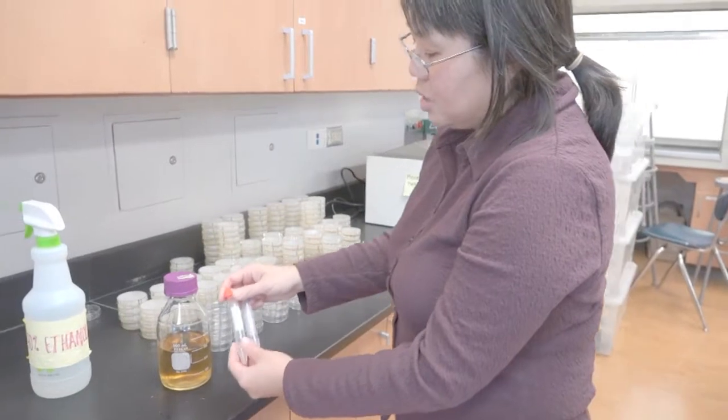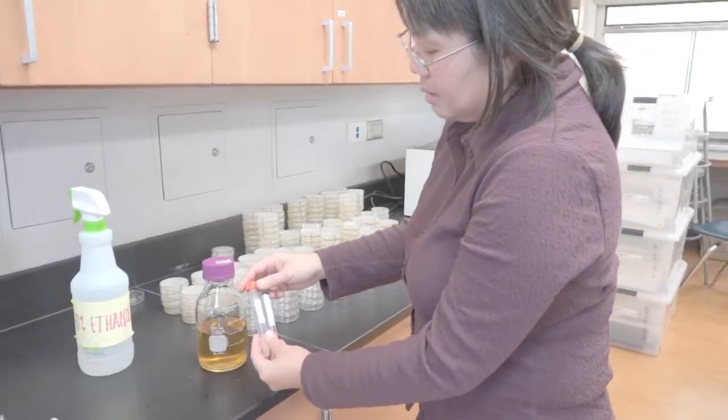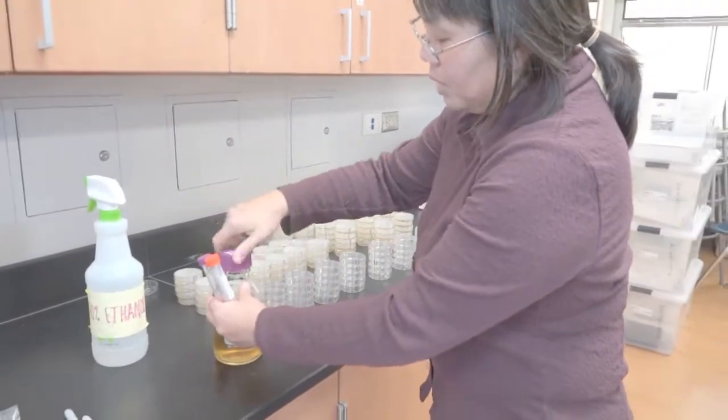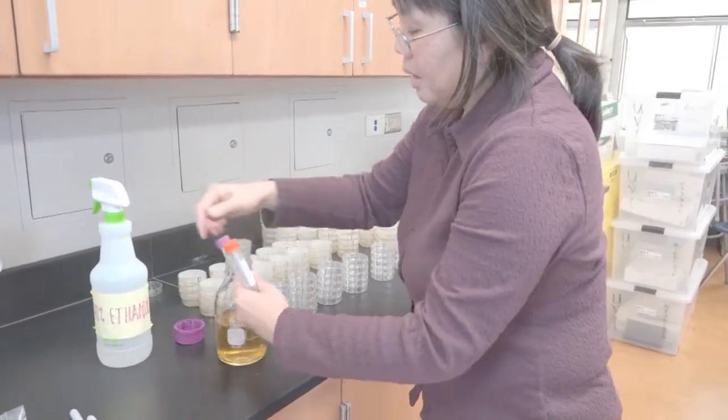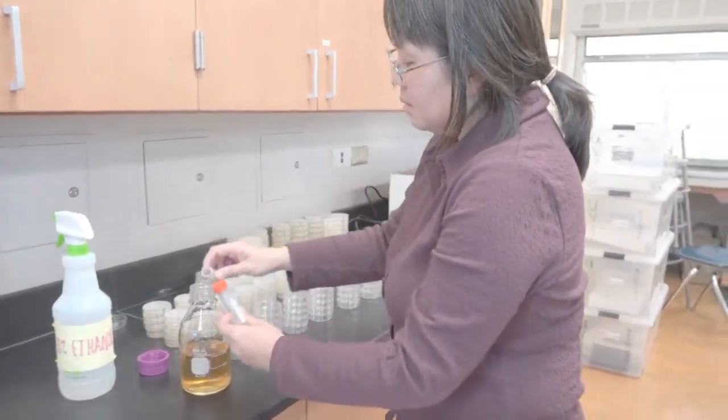We have 3 mils each of Arabinose and Ampicillin, which is the exact amount we need for 300 mils of LB agar. So I just dump it all in.